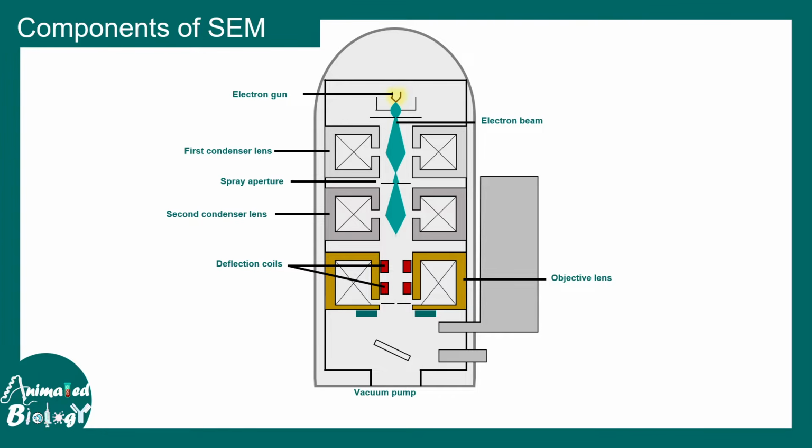Here are the objective lenses in yellow. All of these lenses are actually electromagnetic lenses. If somebody wants to accelerate electrons, they have to use electromagnetic lenses, right? That is how the electron beam can be focused on a narrow volume on the specimen surface, and it can be rastered on a specimen surface in a desired area.